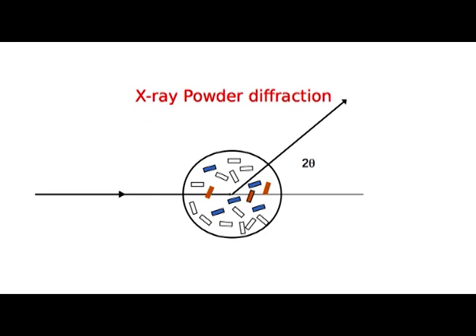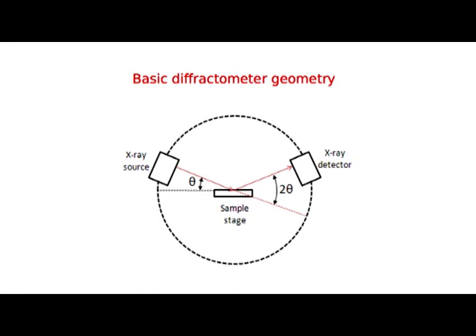We have already seen the formula which governs X-ray powder diffraction. What is that rule? That is Bragg's law, which is n lambda equals 2d sin theta. So, what are the contributions in there? You have the lambda, the d and the theta, right, where theta is the Bragg angle. Provided that your incident X-ray radiation is of constant wavelength, theta is going to be decided by d, the distance between the planes.